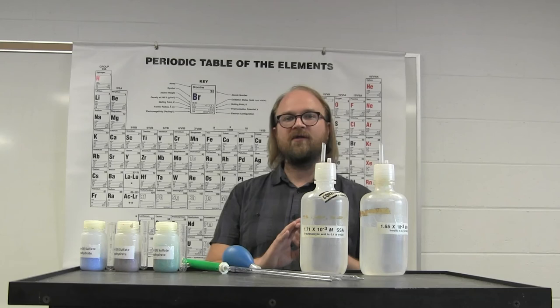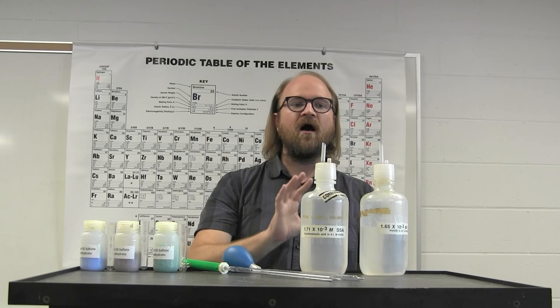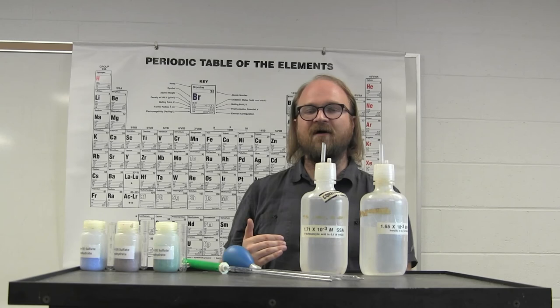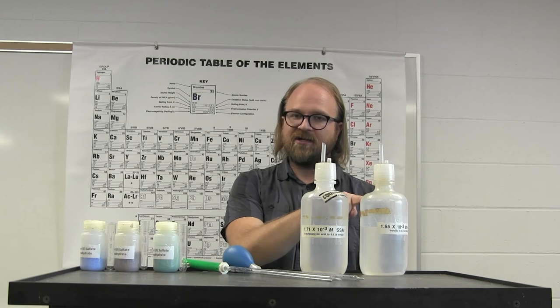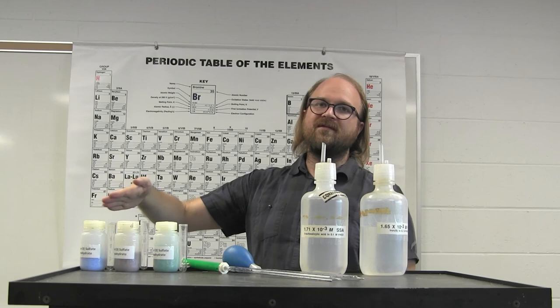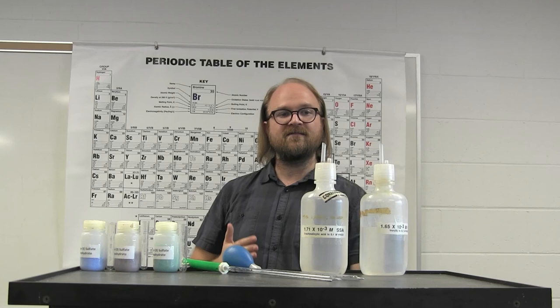How many moles are present of each species, and what is the mole fraction? You're then using that mole fraction and the measured absorbance of the resulting purple product to determine at what point is there that maximum stoichiometric ratio. Look at a graph of the absorbance on the y-axis versus mole fraction on the x-axis and determine at what point is there a peak in the data. Where is the point where the data is increasing in absorbance and then shifts to decreasing. At that point, that maximum amount, that is the stoichiometric ratio of the empirical formula.